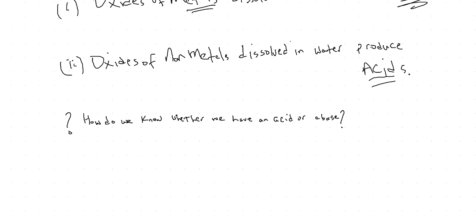What we're going to do is use indicators. There are two indicators we're going to use, so let me tell you the first.